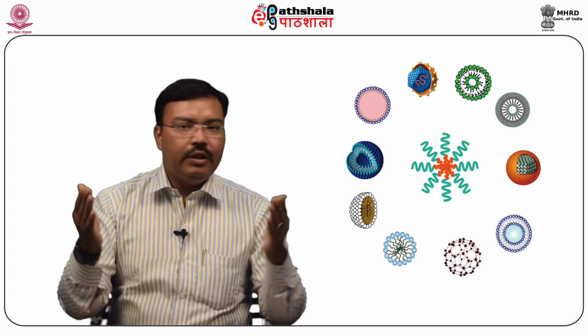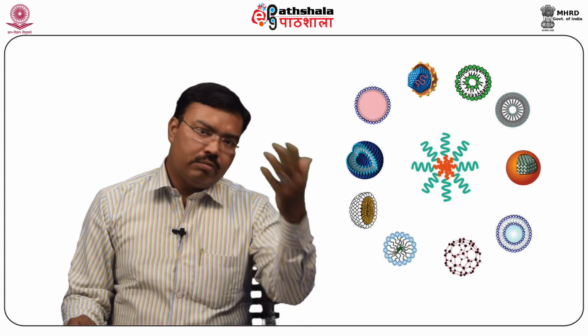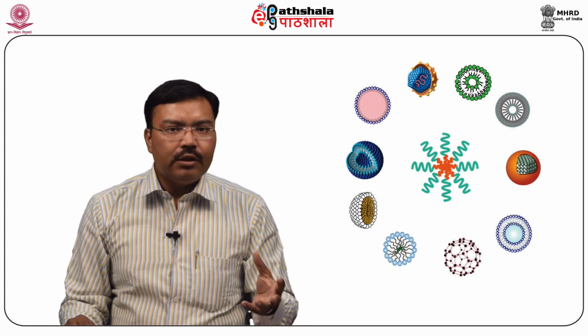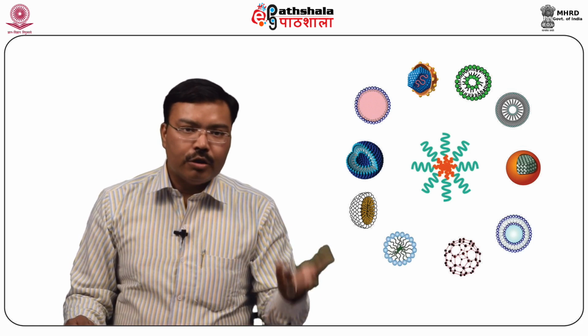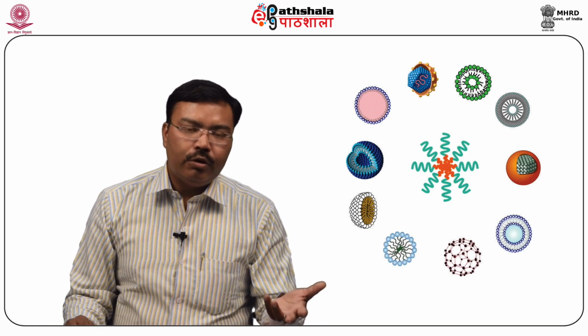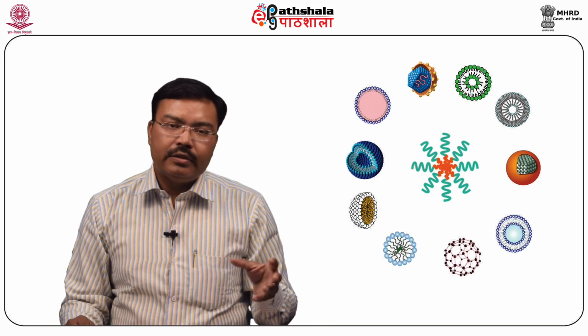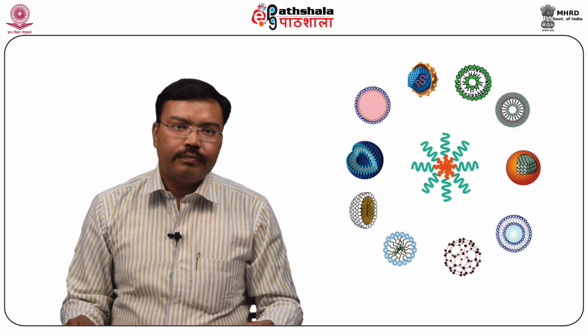In that range we predict the microemulsion as stable. Particles with zeta potential more positive than plus 30 millivolt or more negative than minus 30 millivolt are normally considered a stable microemulsion.